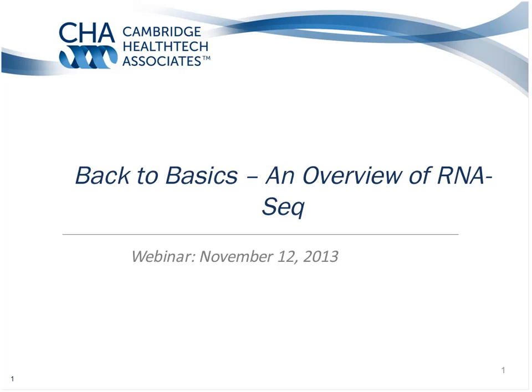So Dr. Colin Dewey will be speaking about one revolutionary aspect of RNA-Seq technology, which is its ability to provide information regarding transcript abundances in species whose genomes have not yet been sequenced. In such situations, transcript quantification involves a combination of de novo assembly and abundance estimation, both of which are challenging tasks when a reference genome is unavailable. Dr. Dewey will describe the basic steps.